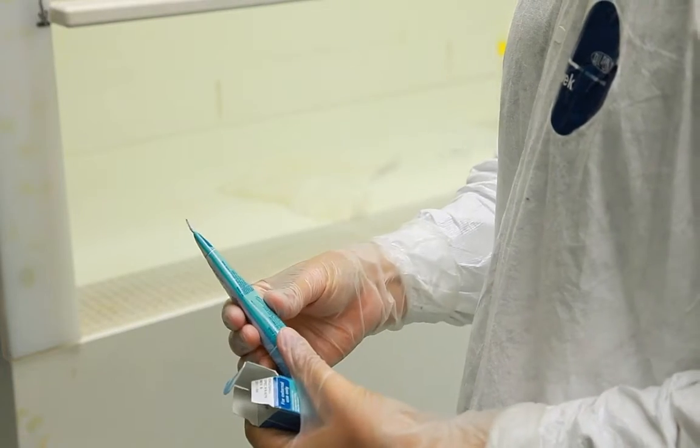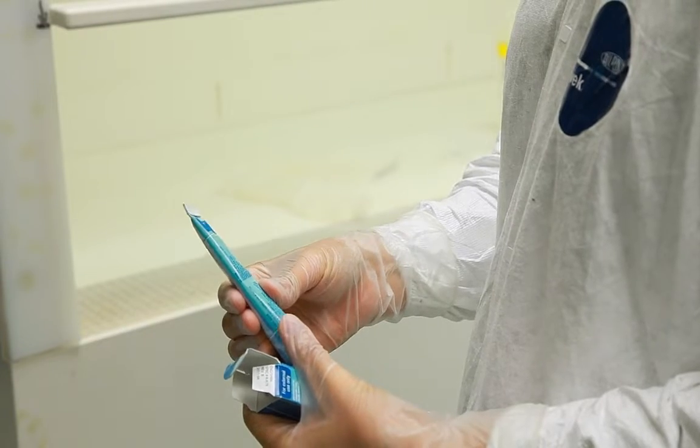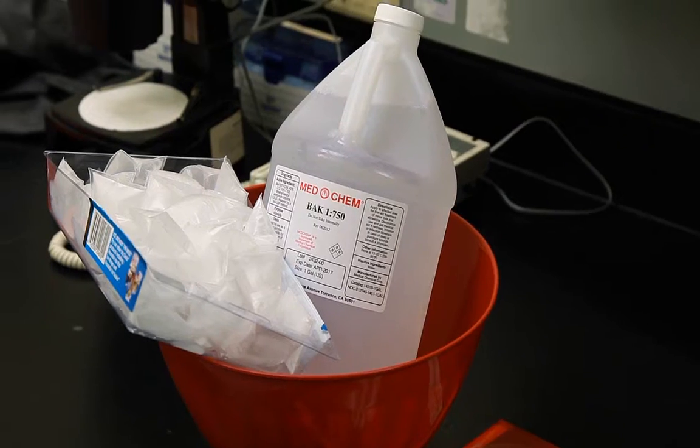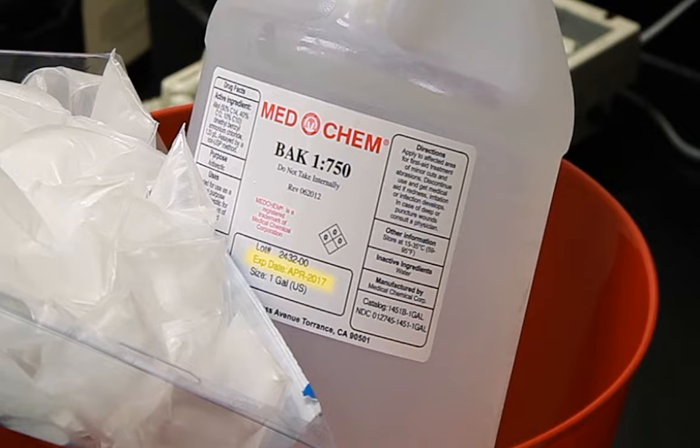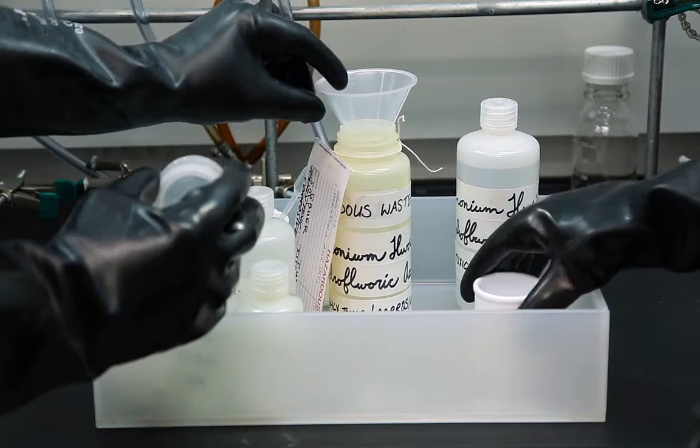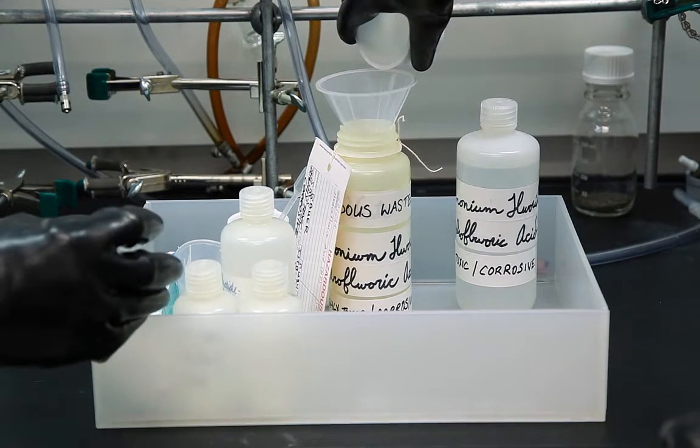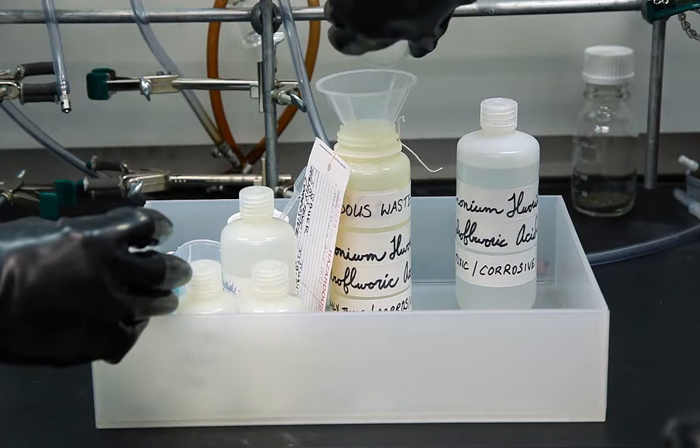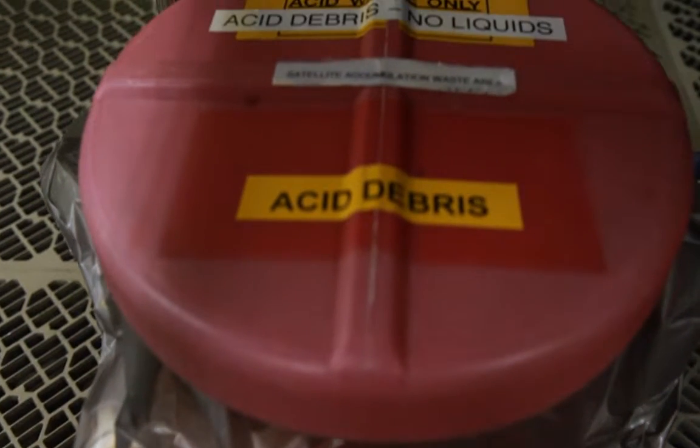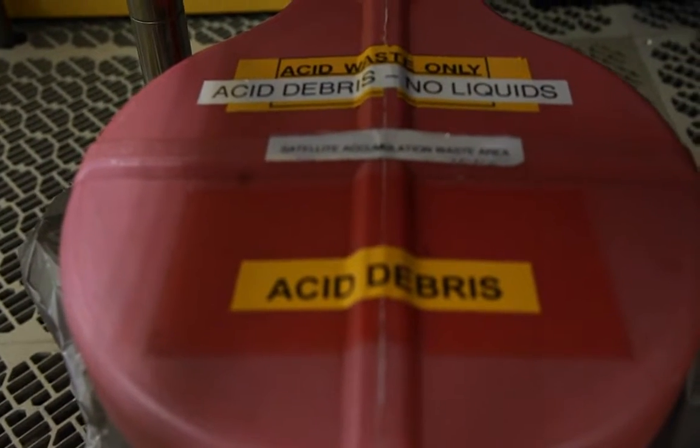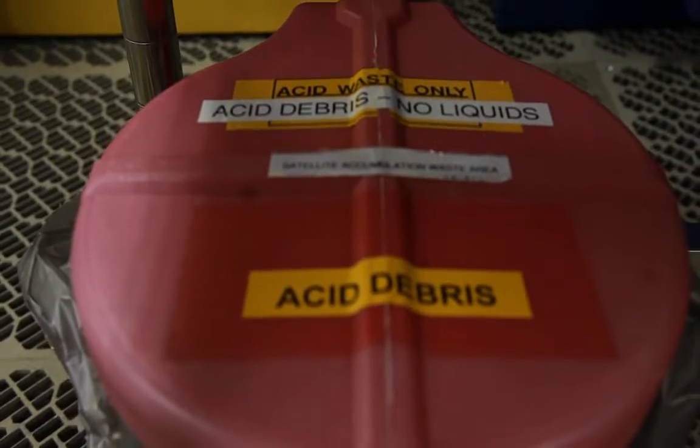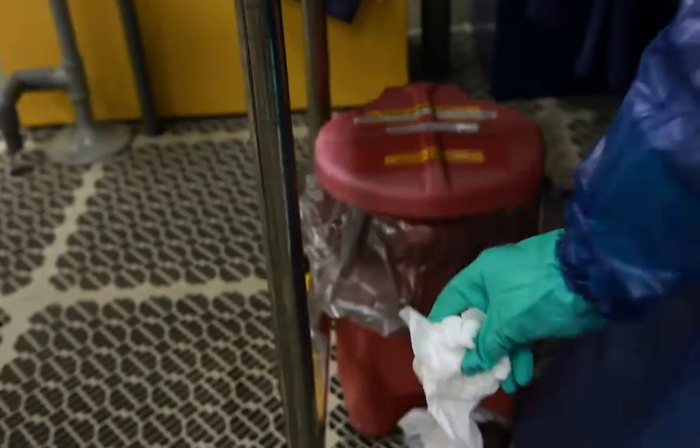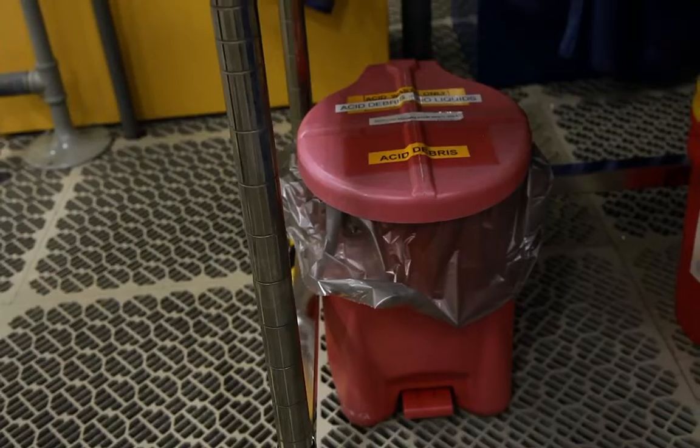When ordering HF, assess your HF-specific spill kit and verify your antidote supply is adequate and within the expiration date. HF waste must be collected in plastic containers, which are purchased and provided by laboratory management. Recommended waste containers must be leak-proof and compatible. Follow your laboratory's standard operating procedure, or SOP, when collecting hazardous waste.